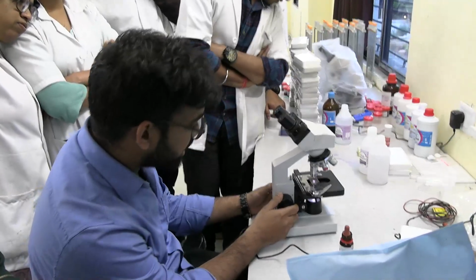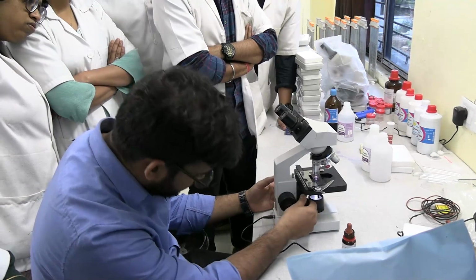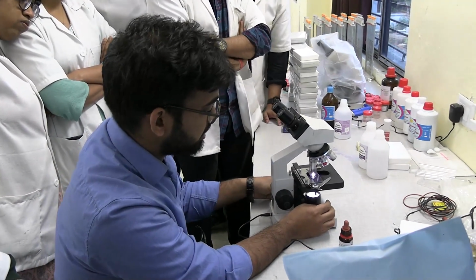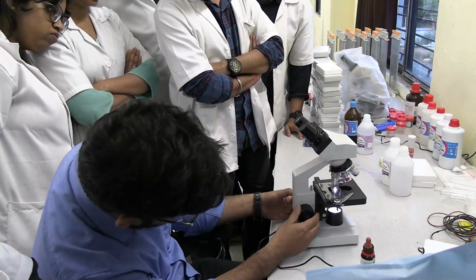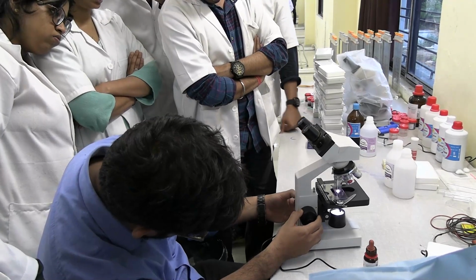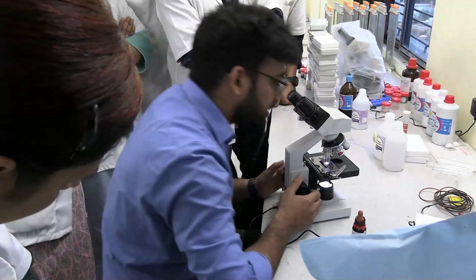How can you focus in 100x? First of all, by using the coarse adjustment, first open the diaphragm fully. Increase the light source, okay? We have fully increased it, and then by coarse adjustment you will make it touch. Okay, it has touched. Now slowly we will go.